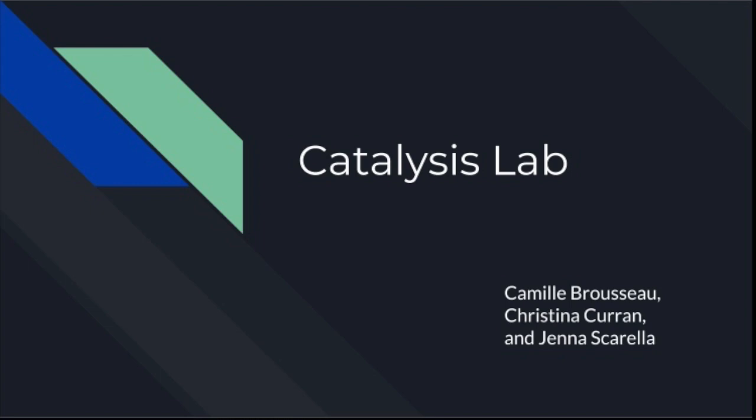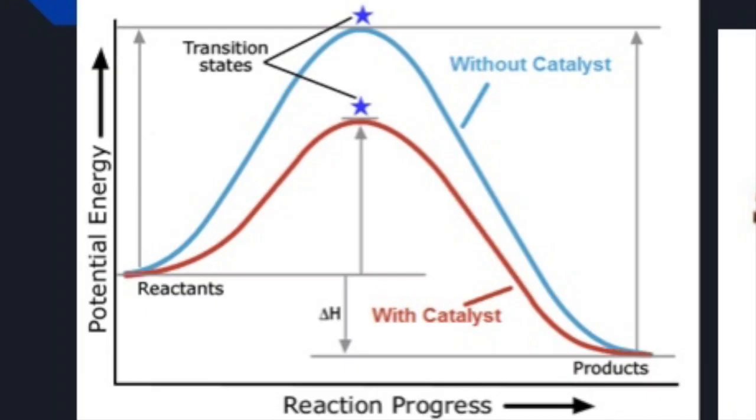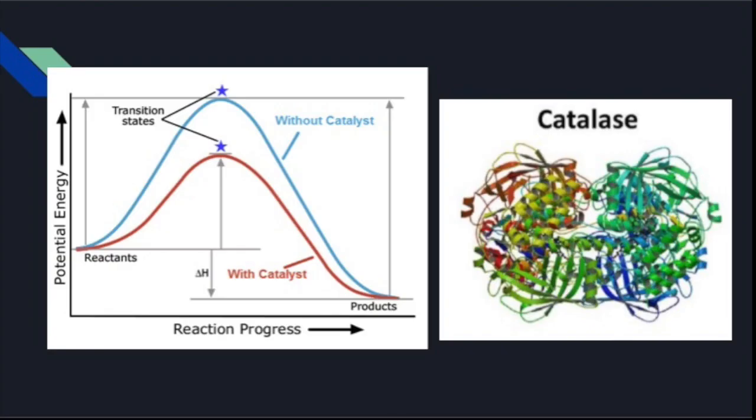The purpose of this lab was to discover the effect that catalase has on the rate of reaction. A catalyst is something that increases the rate of a reaction without being consumed by that reaction. It lowers the activation energy of the reaction.